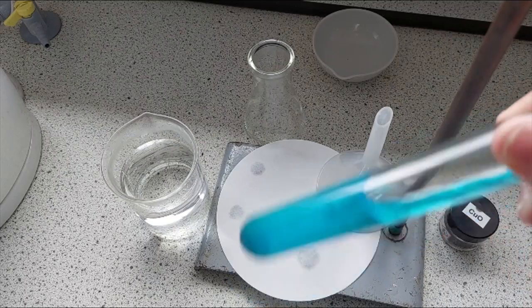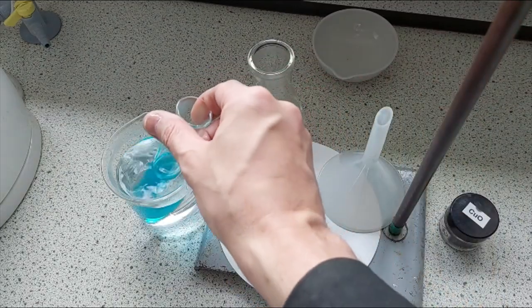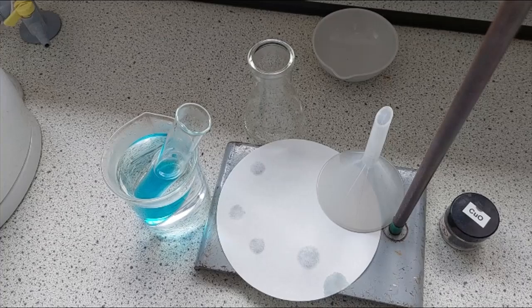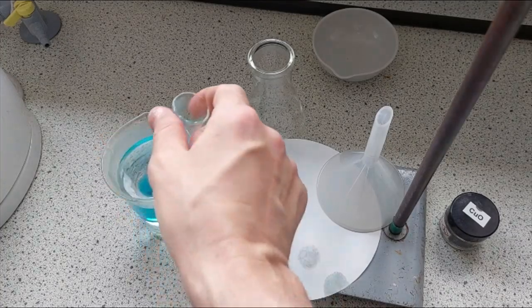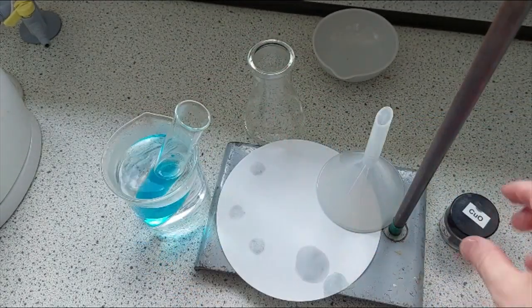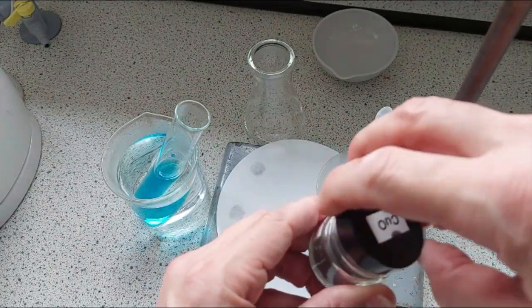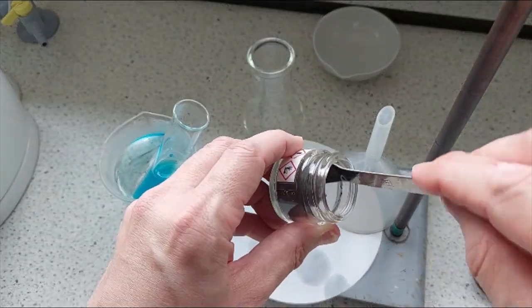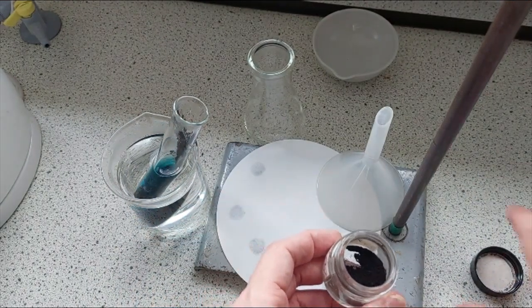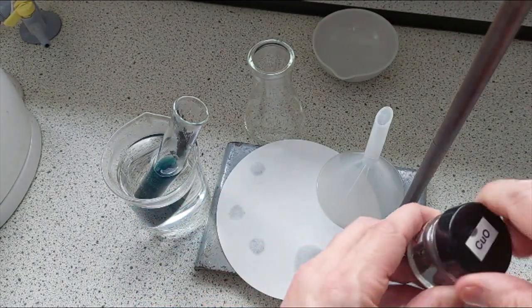And to do that, what we do is we add the copper oxide in excess. Now what in excess means is you add more copper oxide than you need. If there's more copper oxide than you need in the liquid, it will react with all of the acid, leaving none behind. Now you can see there's a tiny bit of copper oxide powder still left in there, so I'm going to add another spatula of copper oxide powder just to be sure that all of the sulfuric acid has been reacted. So I'll pop that in there, and once again I'll start swirling it.